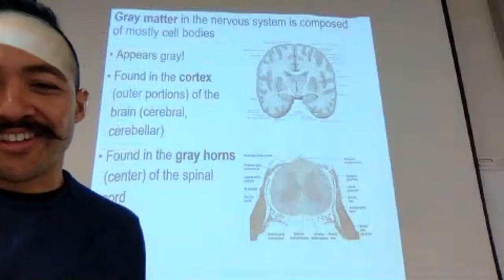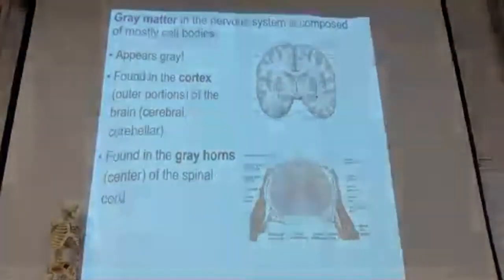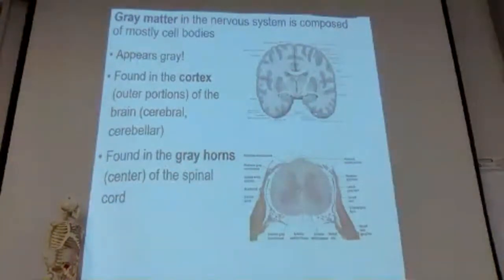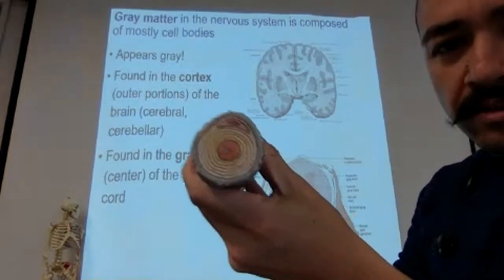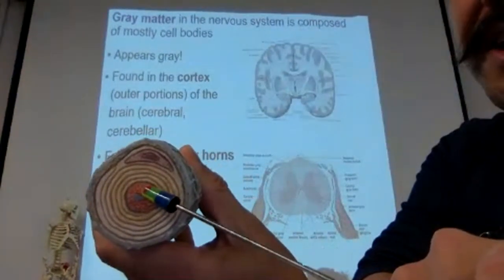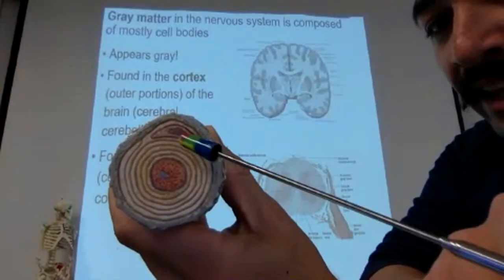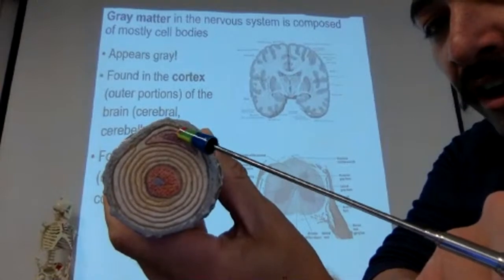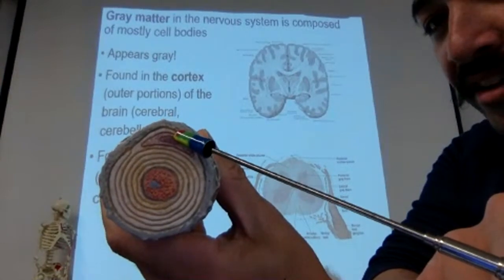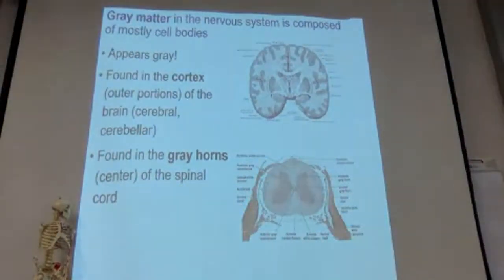So, was the pink thing on the cross section the nucleus of the Schwann cell? It was. Well, so here's the axon. So this is not a nucleus. This is the axon cross section. Then you have myelin, and then here's the nucleus of the Schwann cell.